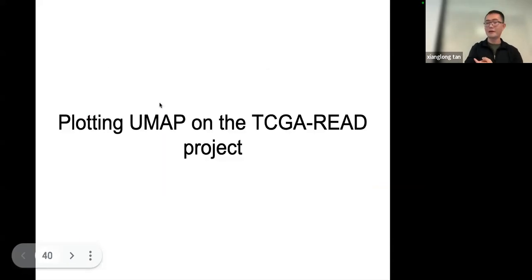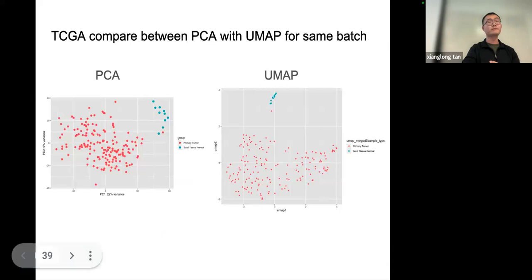And this is a good indicator to show, okay, their controls are normal, they cluster with each other, they're fine, which means that there's no significant batch effect in this data set. Otherwise, if the control samples are scattered everywhere, there could be a potential indicator that their data quality is not that good. So it could be so-called batch effect from different sample collections, or data treatment, etc.